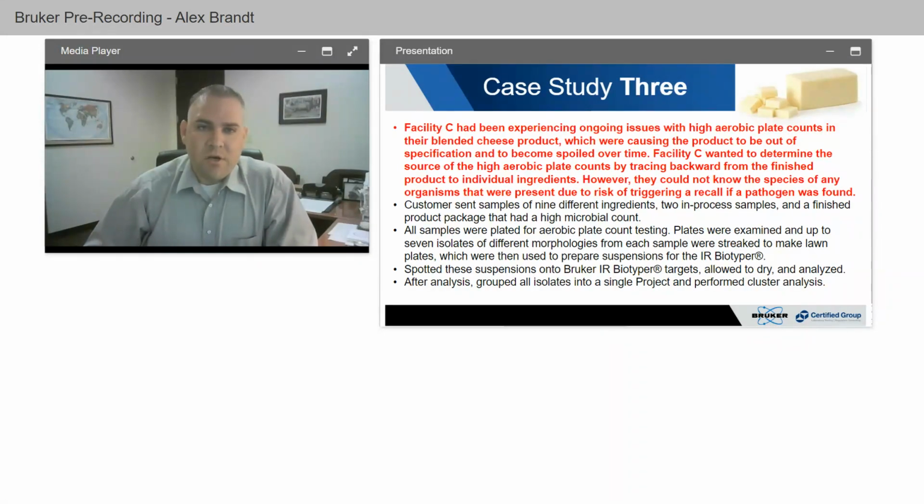So the third case study we'll talk about is with Facility C, we'll call them. They had been experiencing ongoing issues with high aerobic plate counts in their blended cheese product. And these were causing the product to be out of specification and to become spoiled over time. So not a pathogen issue in this case study. This one was actually a spoilage issue.